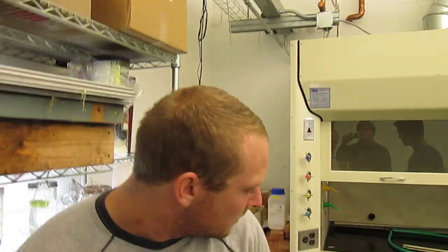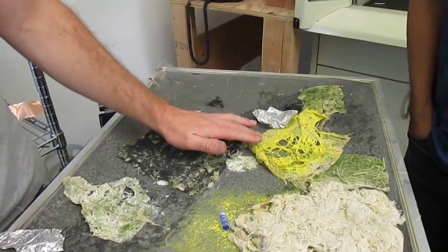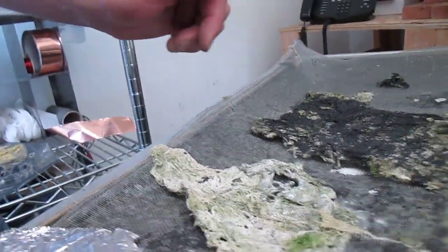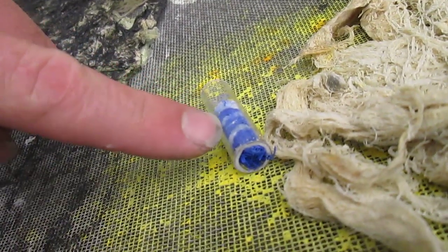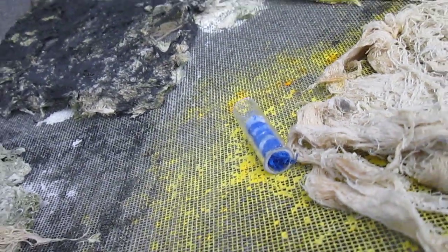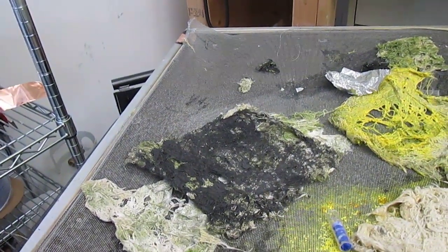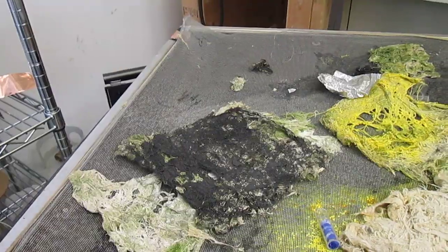Let's have a look at these algae samples. Right here we have algae that has been dried and coated with thermochromatic pigment — this is going to change color. We have a blue color here too, but this one is not going to change right now because the white material in there should be a gel but it has actually solidified, so it is not crystalline. The crystalline structure is not going to allow the properties that we are looking for, so we are still looking at an intermediate. This is the composite algae that we are using — we dry sheets of algae and then coat it with conductive materials to create a matrix that is conductive and operates kind of like a fishnet for energy storage. We trap energy in that matrix and then we can release it later.